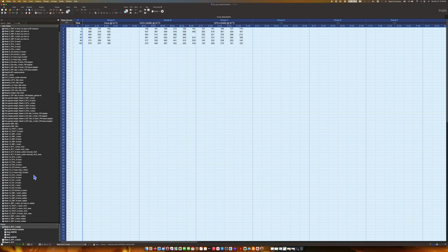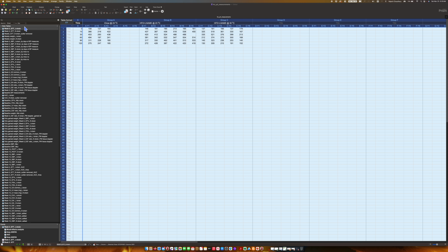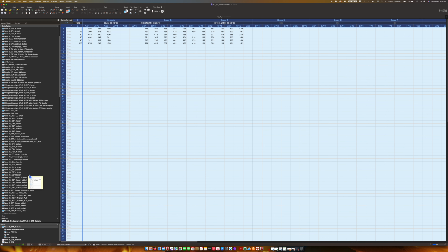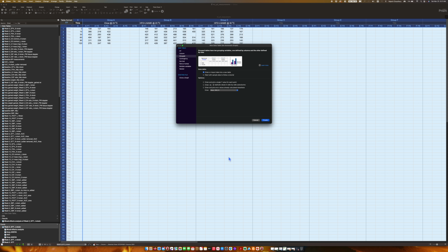So we basically have to find the same data. We are dealing with the week 5 GTT data. We have to find something that I have already done before. So this is somewhere in the middle. So this is the week 5 GTT strain. Once you hit that plus button over here and then the new table, it will give you a window something like this.